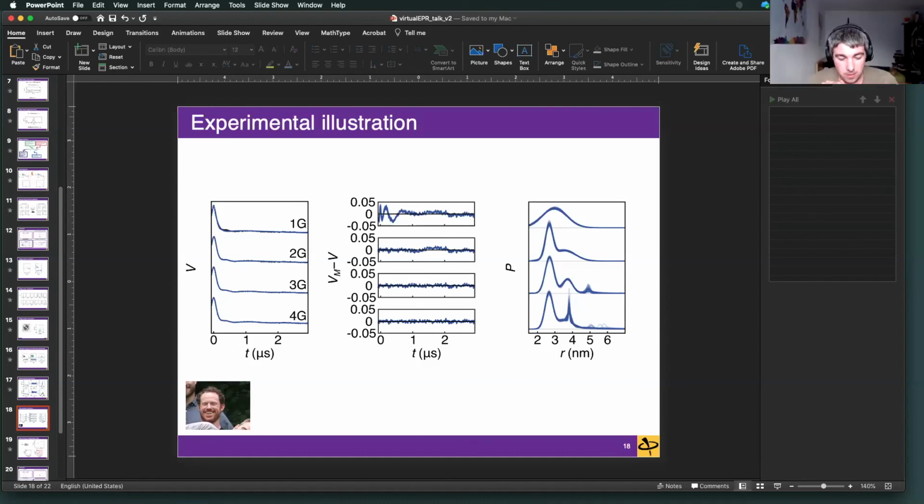No, not exactly. In principle, here is also a background fit included. So in your parametric model, there's of course a background, or parameters for the background. Yeah, there is a background. From that, you could extract the background and a form factor. Not that it is helpful for your analysis, but just for visualization of the dipolar spectra. And my question is then, do you think it is helpful to look at the dipolar spectra or not?